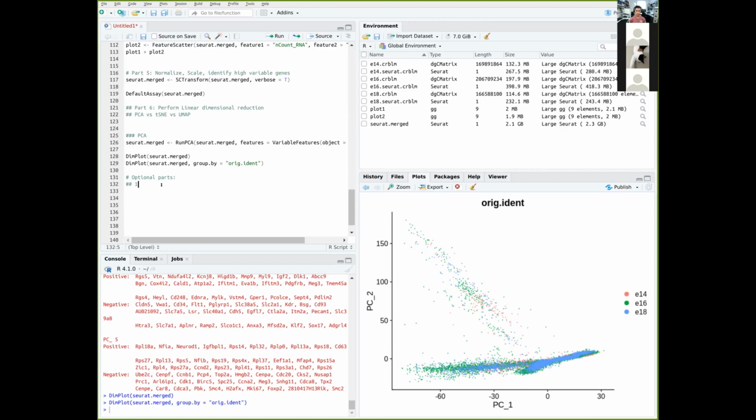If you want to give it a try, perform the regressing of cell cycle genes, as well as determine dataset dimensionality. For the first part, the code will be there, so you can run it when you have a bit of time. For the second part, I don't have the code, but there's a link. It's a very simple set of code, I think 4 or 5 lines.